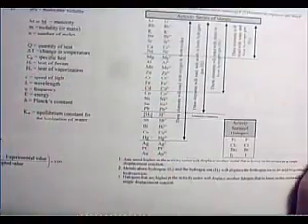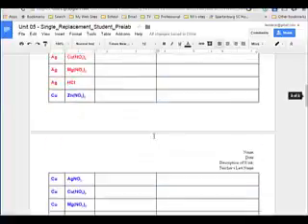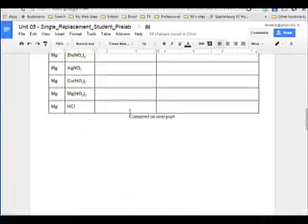Let's look at what I predicted here then. I said this reaction will not occur. That's my prediction. Then I said, why is this? Silver, the metal, is less active than the zinc ion in the zinc nitrate. And I said, we know that silver is less active because it's lower on the activity series of metals than is zinc. Okay? So you're going to complete filling out this chart here. I've basically given you 4 of them, and there's 20 altogether.